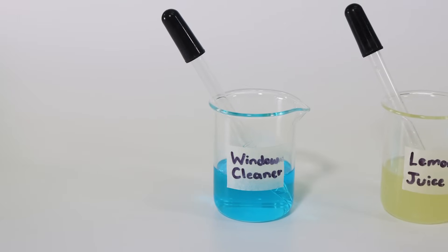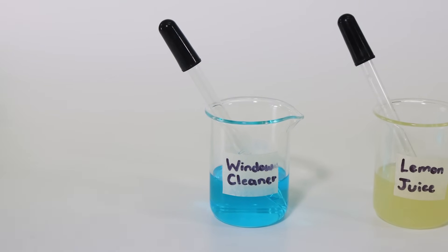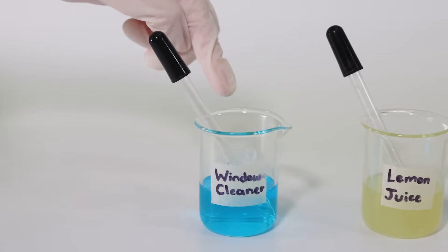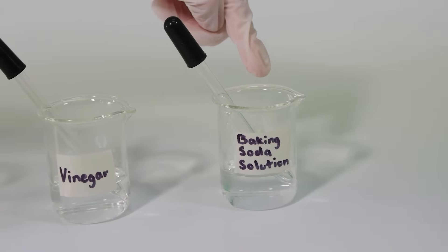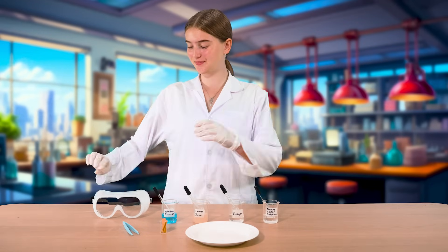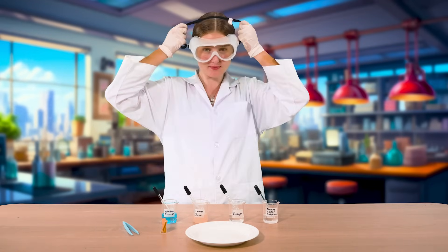We have four beakers, each containing a different substance: window cleaner, lemon juice, vinegar, and baking soda solution. We'll use eyedroppers to apply a small amount of each substance to a strip of litmus paper.